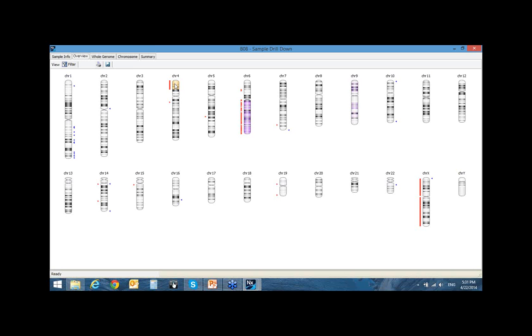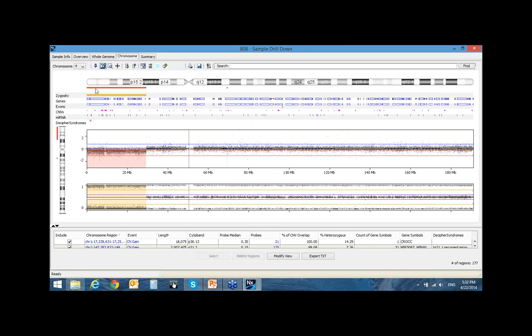You can see chromosome 4 has a big loss region at the tip, and then you can go in there and look at this copy number loss plus the LOH call, because you only have one copy of the chromosome region in chromosome 4, and here you should see a beautiful two-band pattern in the B allele frequency. That means you only have one copy because those are either A-call or B-call. You lose the middle band. Like here we have 3 bands, you only have 2.